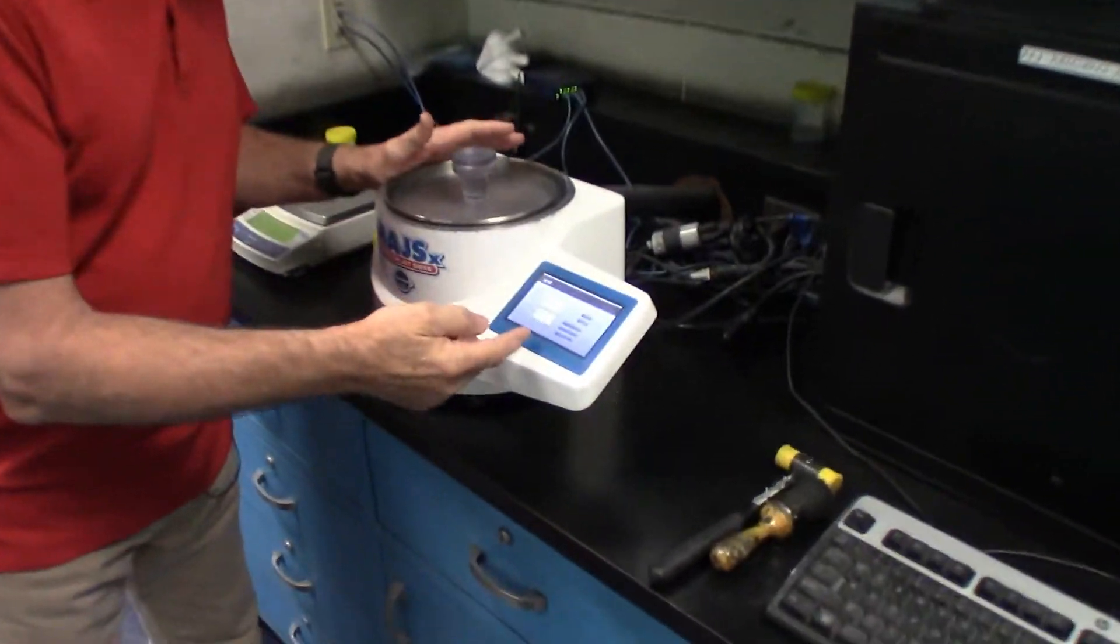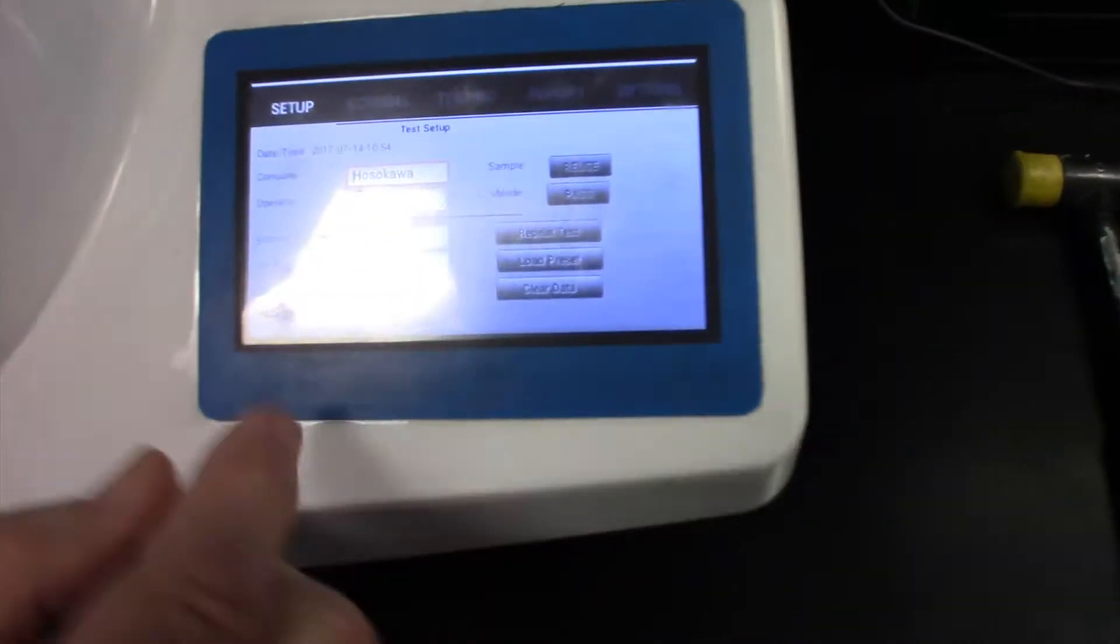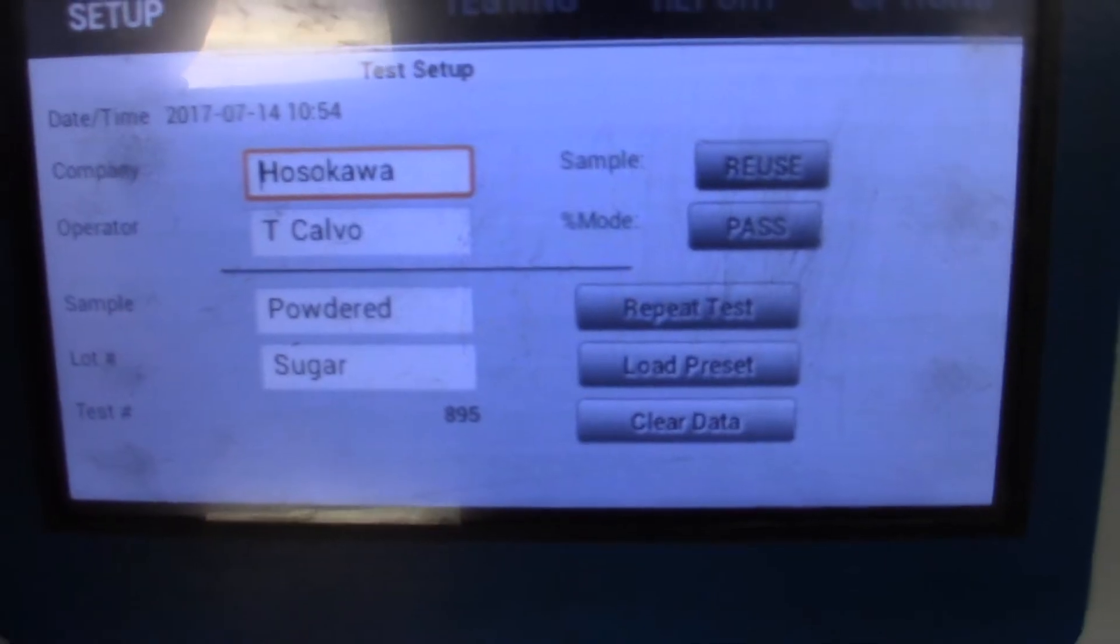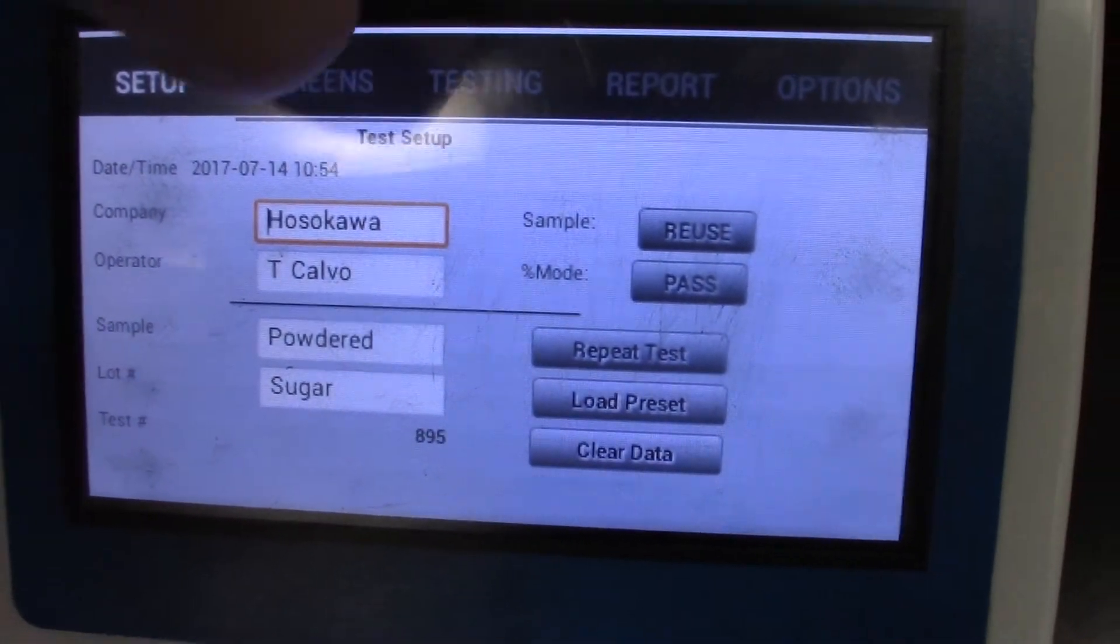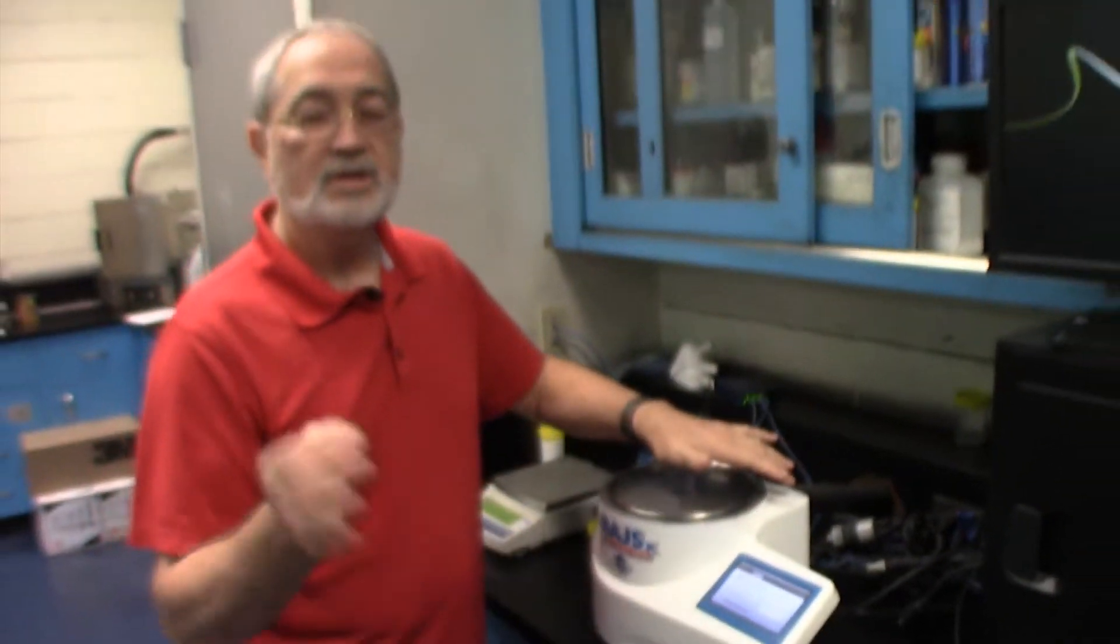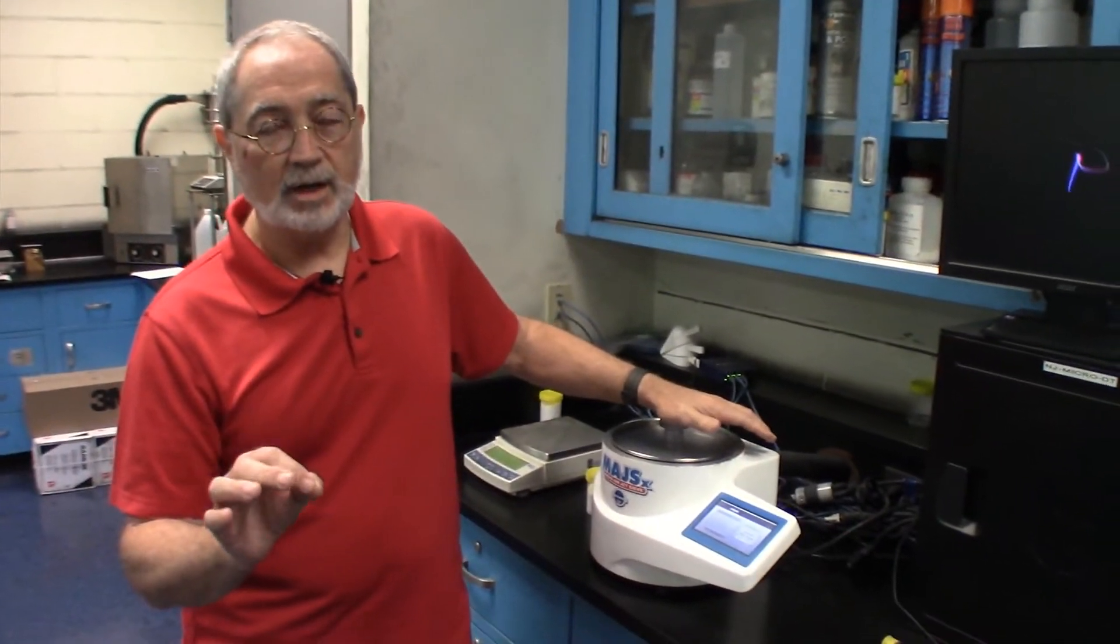I've taken the liberty of pre-setting up the Airjet sieve to show the sample, or at least the setup page. We typically measure against the 75 micron, otherwise known as a 200 mesh screen.